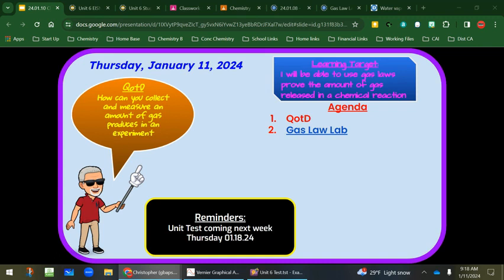What's it hooked up to? Nothing. So what's it reading? Nothing. Nope. Still reading something. The air. Room gas. It's reading the air pressure pushing onto the inside of the sensor. Yeah. So we can actually measure that.